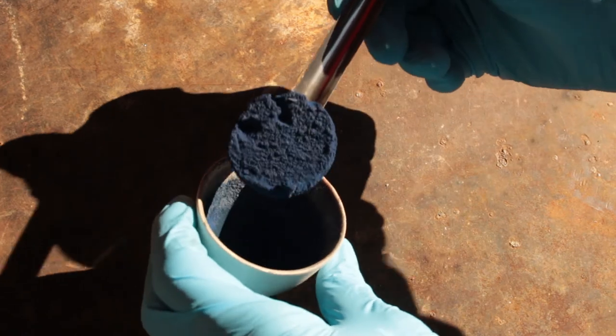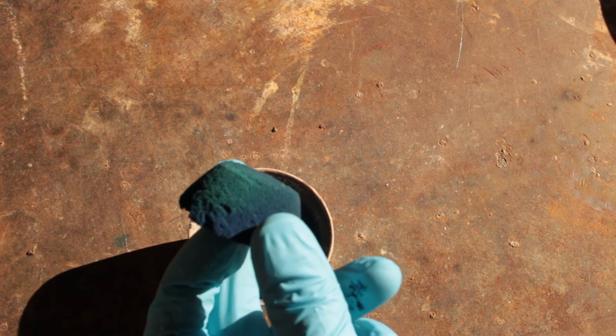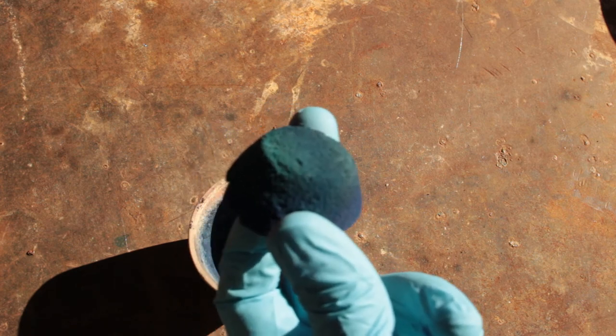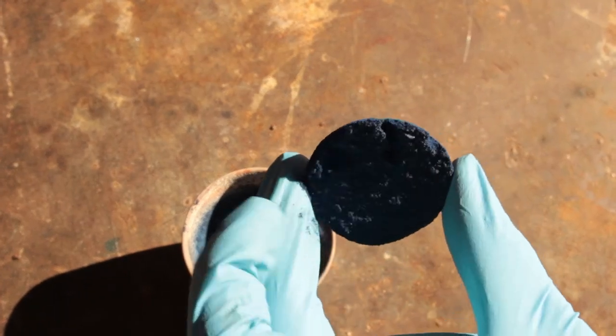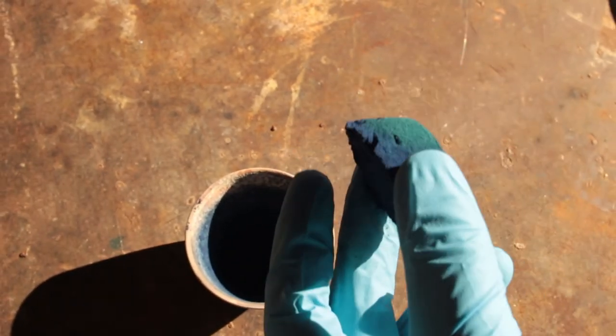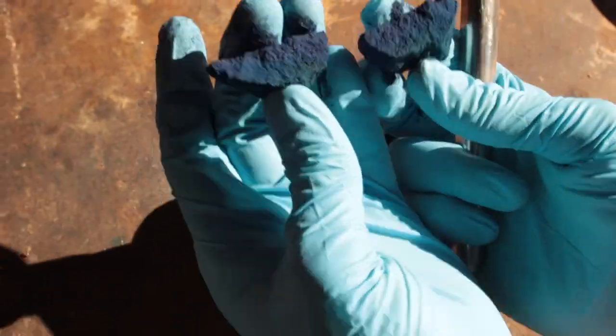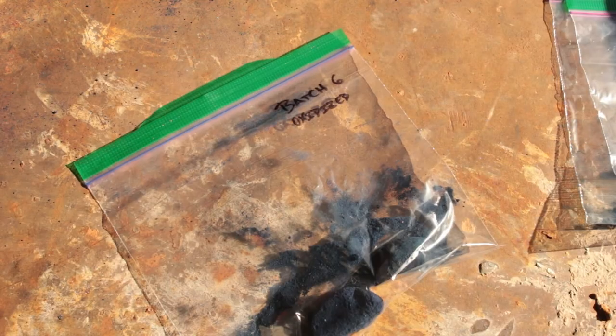I will point out that some of the later trials did result in slightly less vibrant blues, so perhaps I'm wrong, or perhaps I just didn't have sufficient temperature control. And there you have it — the product you just saw being made. It looks kind of gray in this shot, but it's really more blue in person.